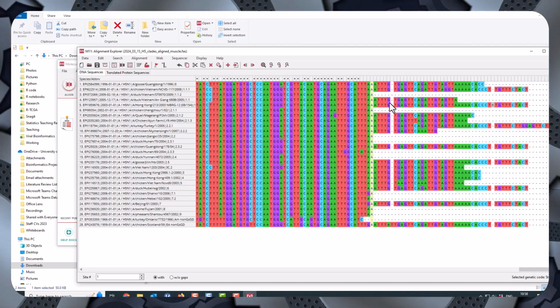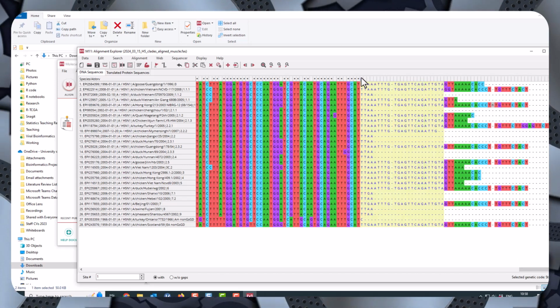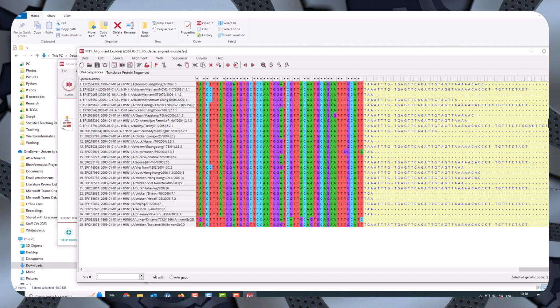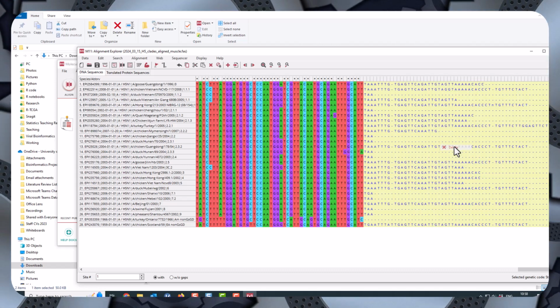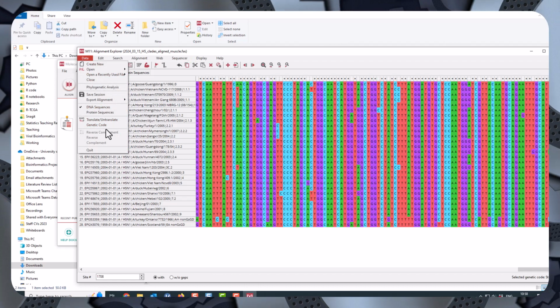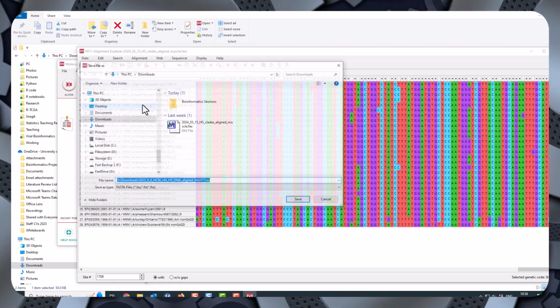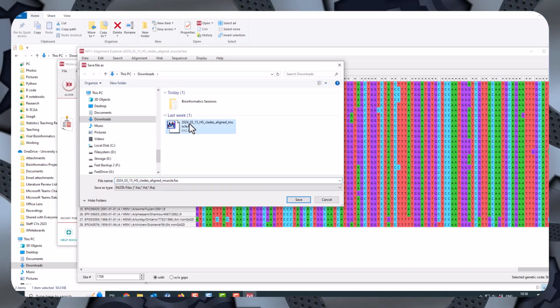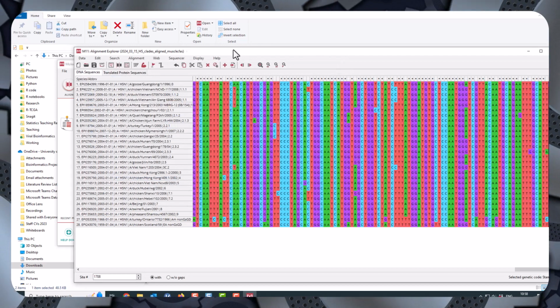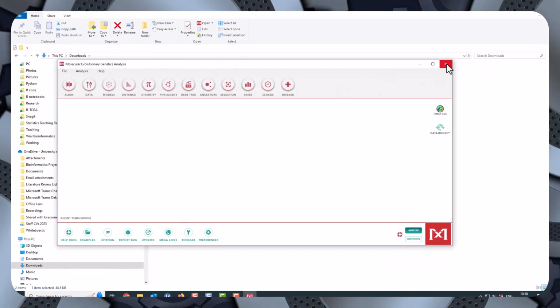The end's very jagged, and it's probably a good idea to remove this. So you have different lengths of sequences. These are non-coding parts of the sequence, so they're past the stop codons. So they're not really that important. So once you've got a good alignment and you've edited it and you're happy with it, I can export this one, and I've just overwritten the original file because all I've done is a bit of truncation. So that's everything done.